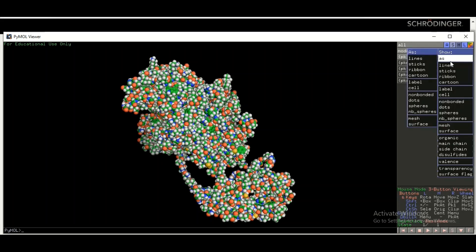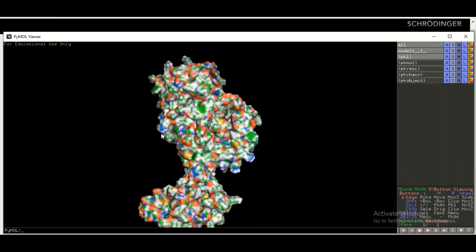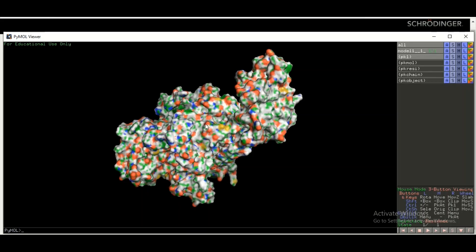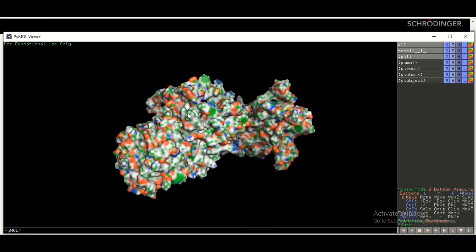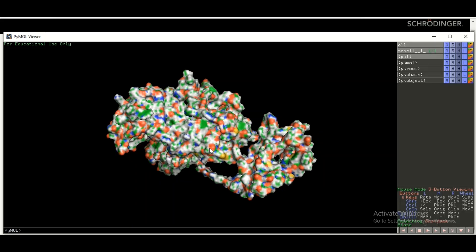If you want to see the protein as a surface, go to S and click on Surface. After a few moments the surface representation of your protein will appear. The surface model is very handy when you want to observe the cavities and charges at the surface of your protein. Understanding these cavities is very important when performing docking analysis, as ligands normally bind at the cavities at the surface of the protein.